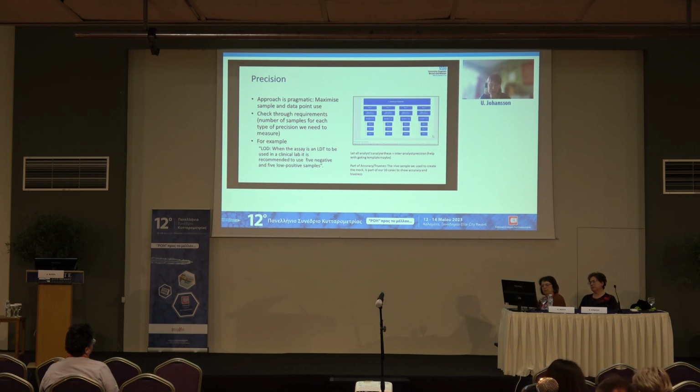So all of a sudden you've got a lot of data points. You even have sample stability if you set up the same sample on day 1, day 2, day 3, day 4, for example. So you can fill out a lot of the required validation entries in a single mega experiment if it's just very carefully planned.